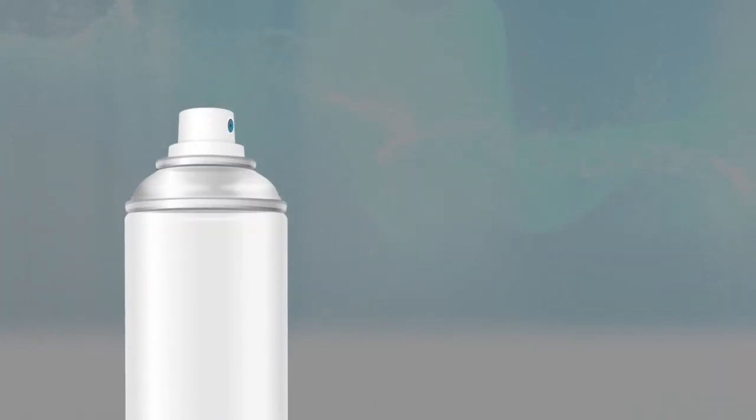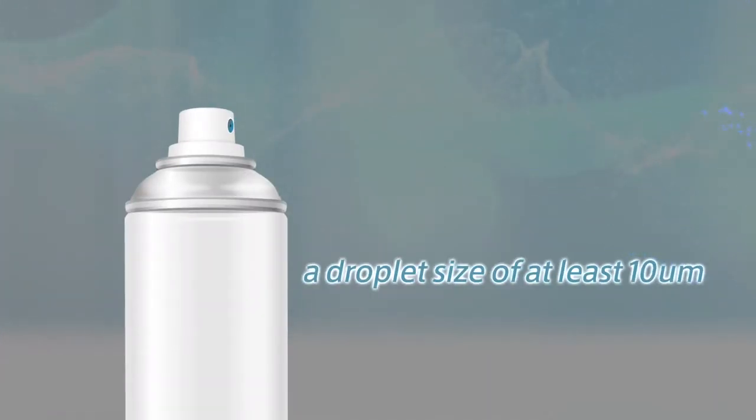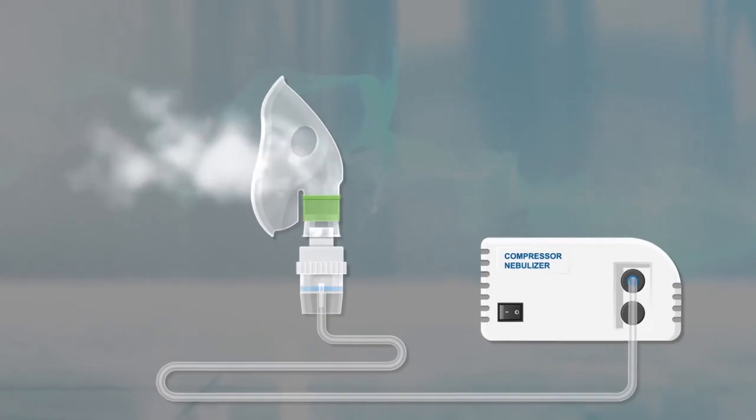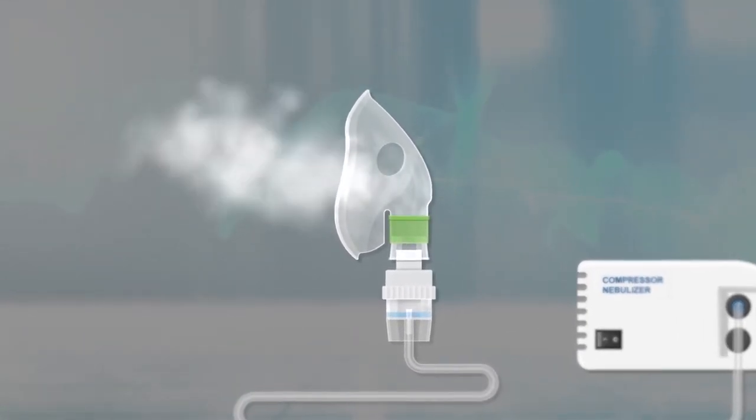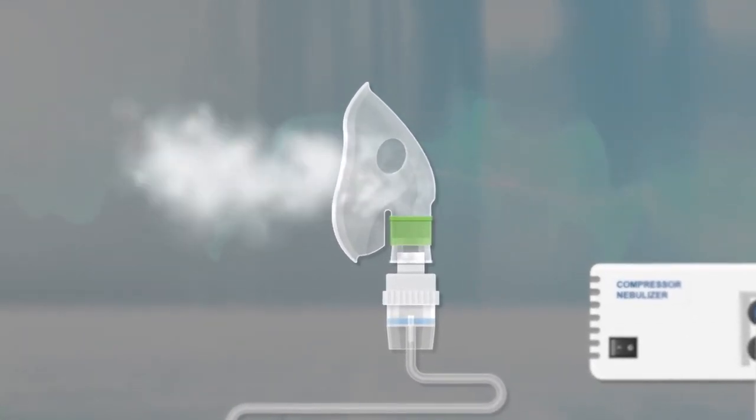Some sprays are waterproof, which requires a droplet size of at least 10 micrometers so it will not harm a person's lungs if inhaled. Nebulizers must control particle size so that the drug reaches its target in a timely fashion.